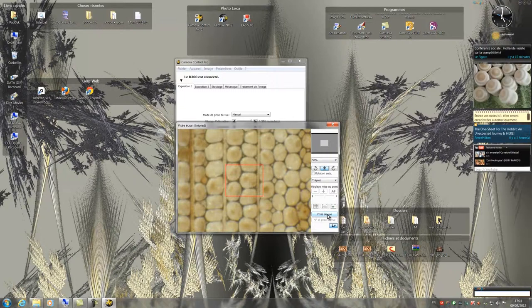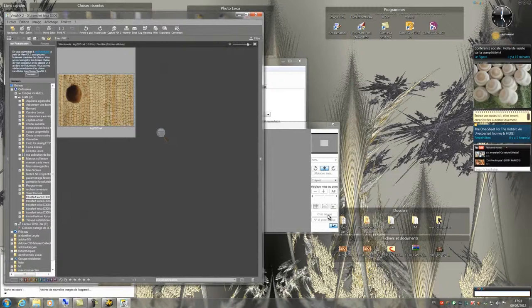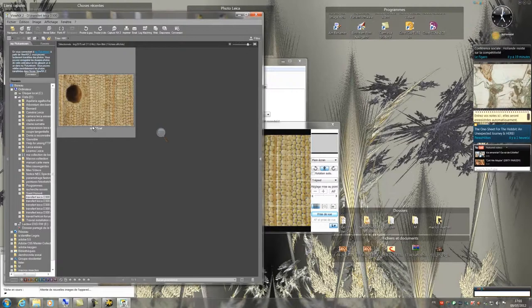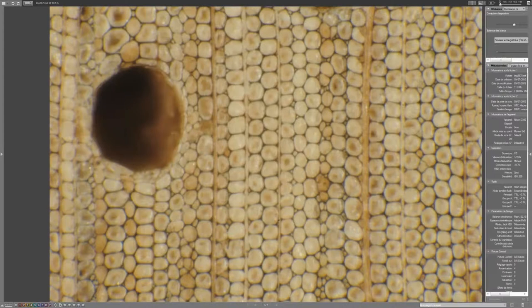I click here to shoot. The picture is taken. The software View NX opens and my picture is displayed. By double clicking on the thumbnail of the image, I can see the picture in full screen and judge the quality of the shot.